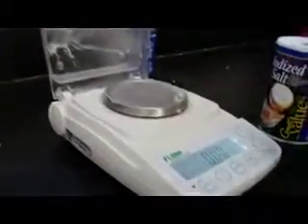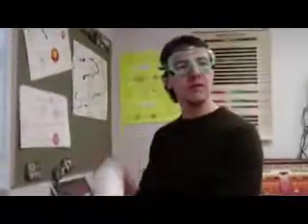But before we do that, let's talk about some other ways that we're going to be dispensing our acid. Okay? Now, sometimes the acid that you're going to use is going to come in a solid form. This is called potassium hydrogen phthalate. This is what you are going to use when you do these in lab to standardize your base. It's very simple to start with a solid acid, because all you have to do is go over to your balance and weigh it out. And I think in the lab we usually have you weigh out about 0.5 grams or so. So it's very simple to start with 0.5 grams of your acid. You now know exactly how many moles of your acid you started with. You do your titration and you can do some math.